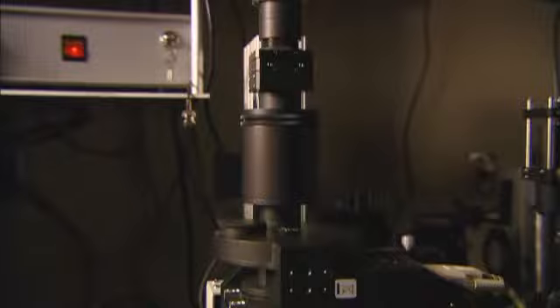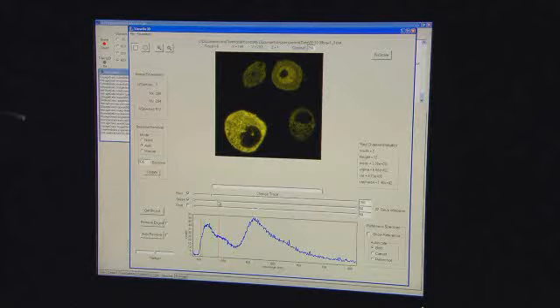Researchers at Sandia National Laboratories have spent years developing the hyperspectral confocal fluorescence microscope system, and now the technology is ready for commercialization.